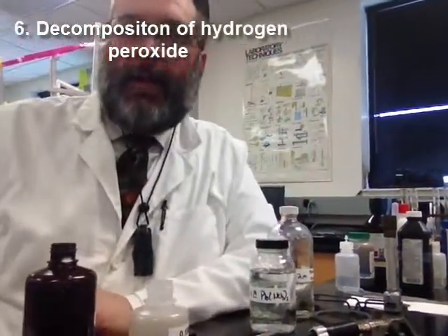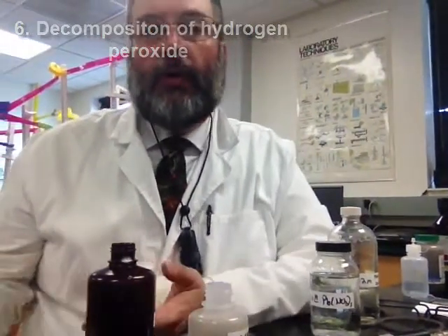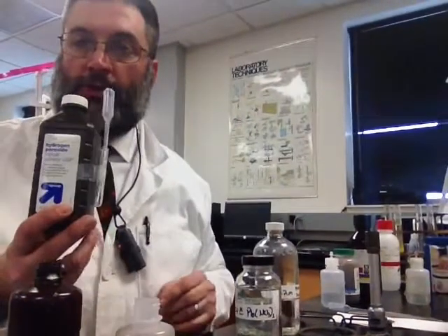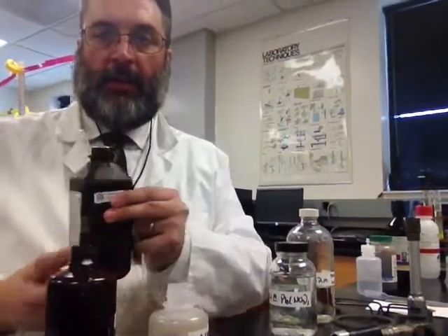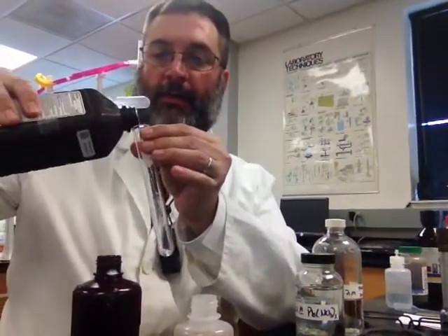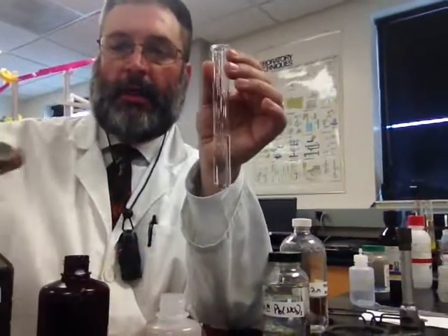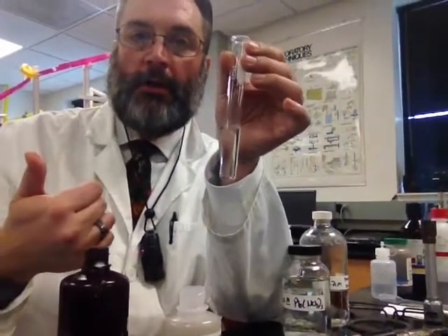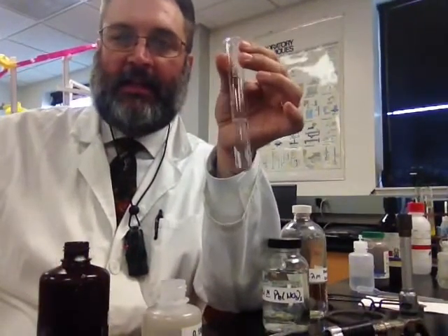Now, decomposition reactions are a little tricky because a lot of them are unsafe to do or require a lot of energy. So I'm going to do a really easy one. This is just store-bought hydrogen peroxide. And hydrogen peroxide undergoes decomposition naturally. It's something that's going to happen the minute I put it into this test tube, but you're not going to see very much because it's slow. Okay? Hydrogen peroxide decomposes into water and oxygen. But because it's so slow, I can't really see anything happening in there.